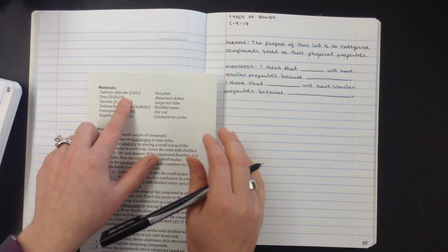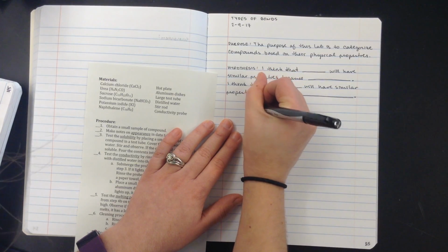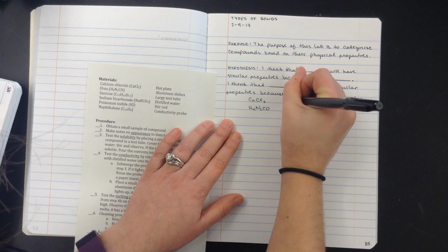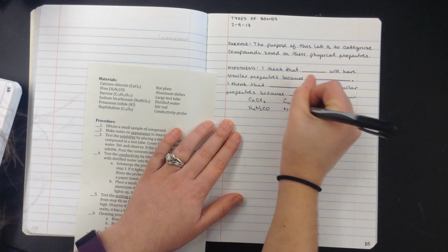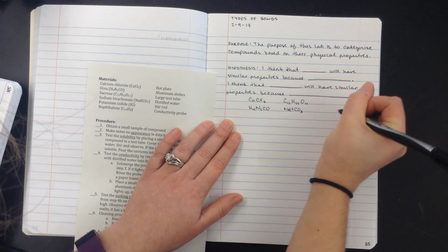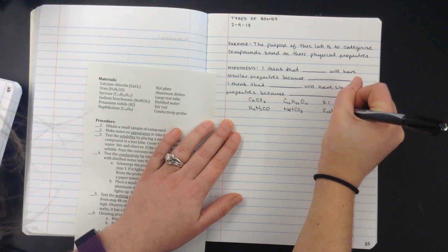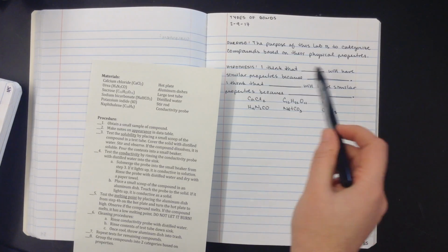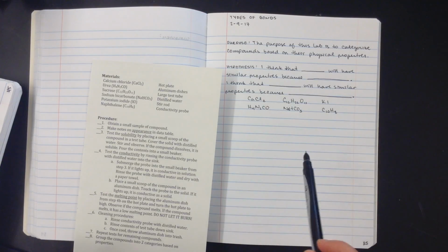So we're going to be using calcium chloride, urea, sucrose, sodium bicarbonate, potassium iodide, and naphthalene. So of those 6, I want you to split them into 2 categories. And I want you to say, I think that these compounds will have similar properties because, and then give a reason. And then I think that these other compounds will have similar properties because, and then give a reason.